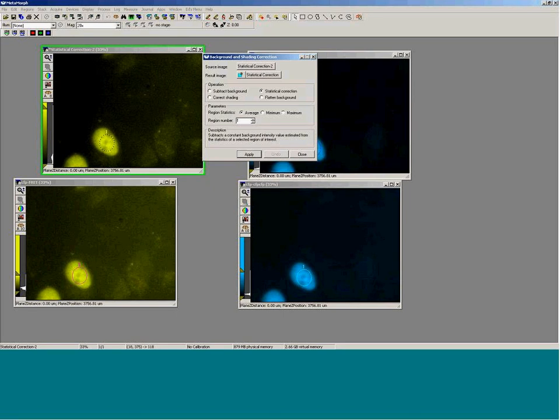Chroma sells colored slides that you can use for fluorescence that work pretty well for looking at shading across the image. If you have uneven illumination, hopefully it can also be fixed by setting up the microscope correctly.